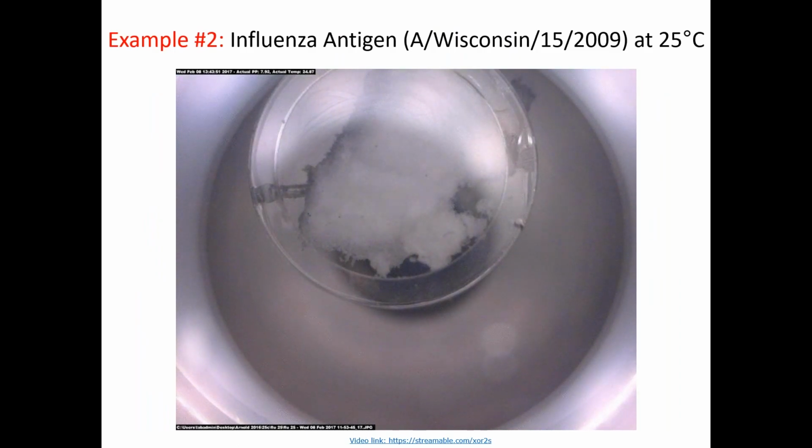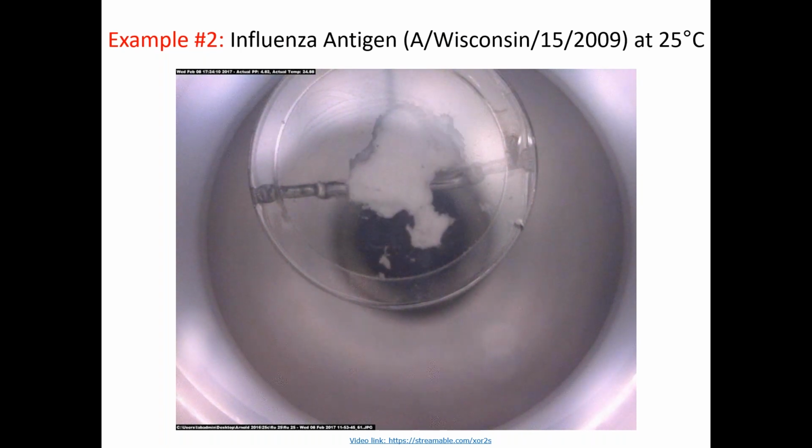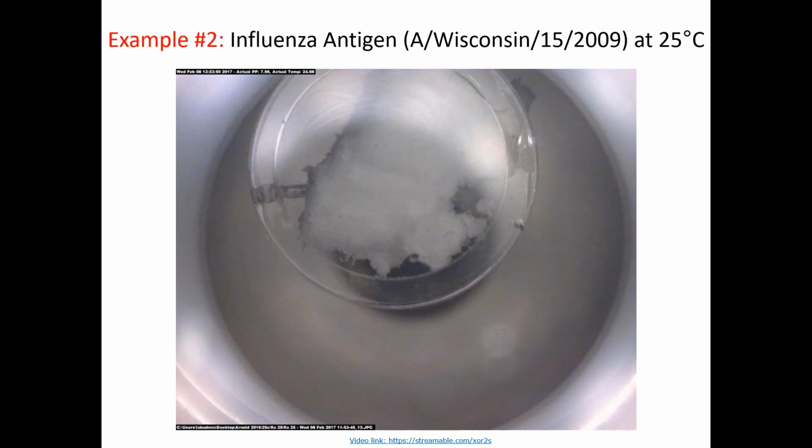So now we're looking at a commercial influenza antigen, again freeze-dried, and you can see there that that collapses quite early on at quite a low humidity.